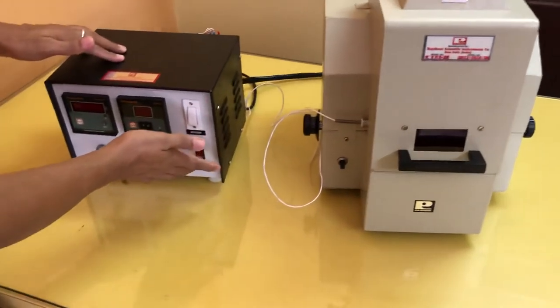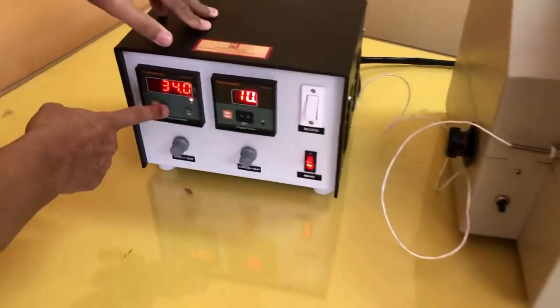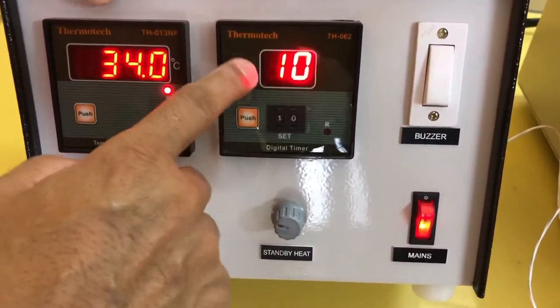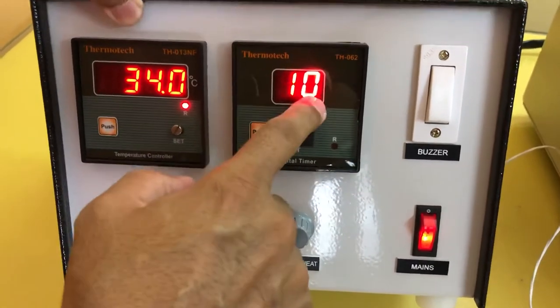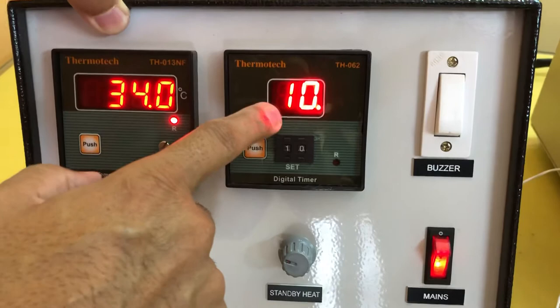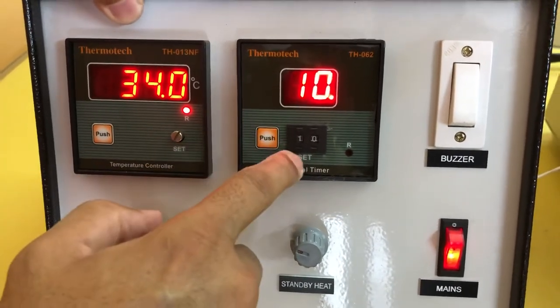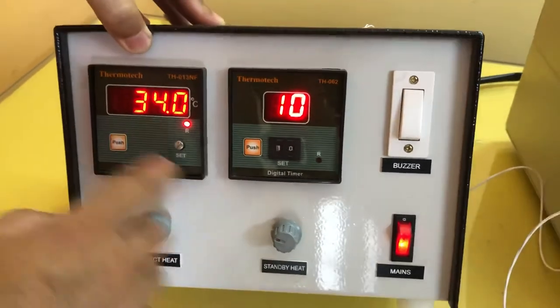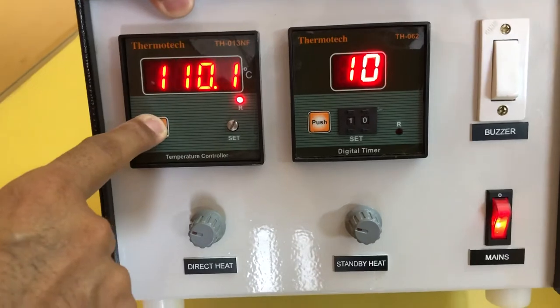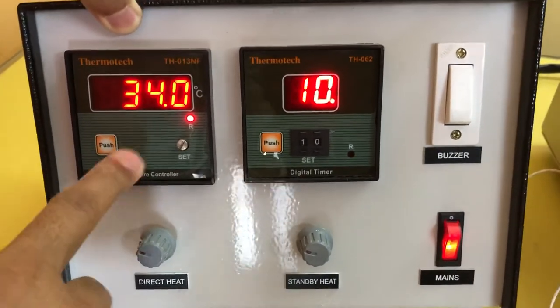Now I will just switch it on. This is a digital temperature controller and this is a digital temperature timer — two digits. Right now it is set for 10 minutes. We can increase or decrease this timing by pressing this push button just below this display. This is a switch. If you push this temperature controller, it shows 110 — meaning we have set temperature to 110.